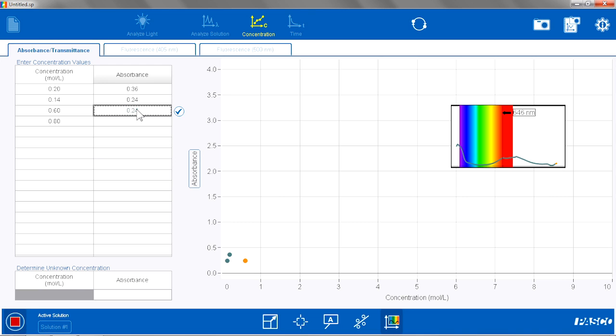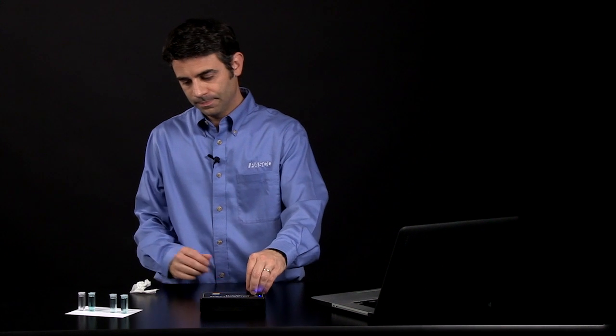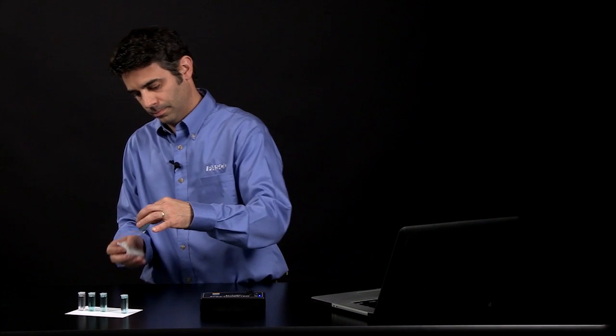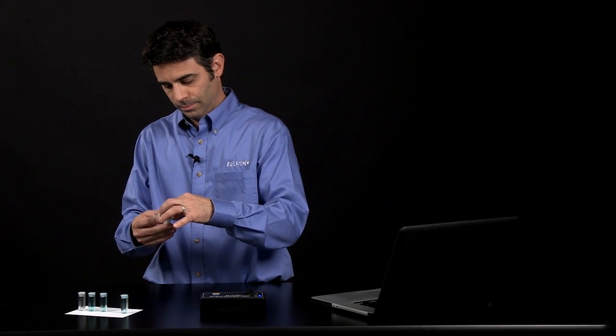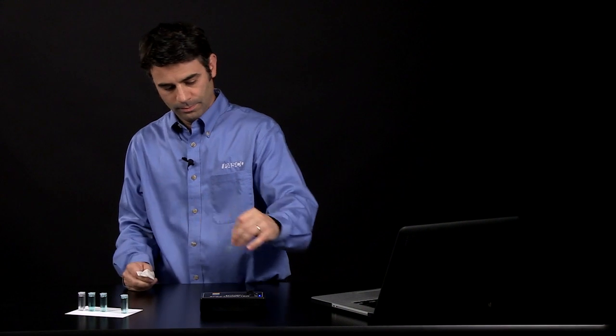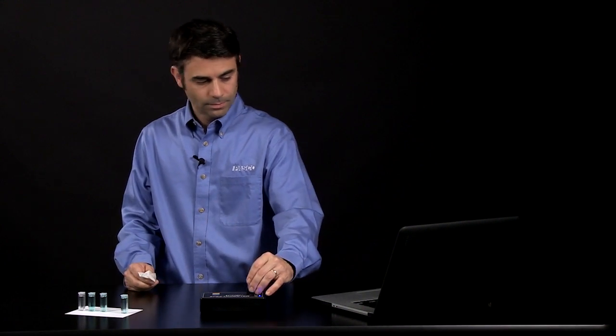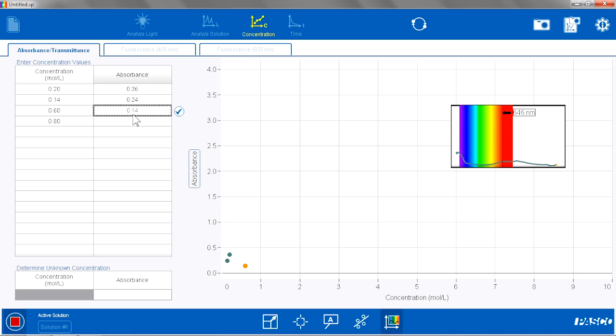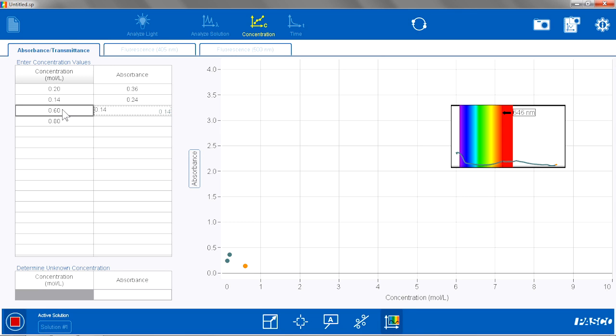I am going to go to my next solution, wait for that to stabilize, and hit Keep the value. I am going to change the concentration for that, which was 0.08 molar.